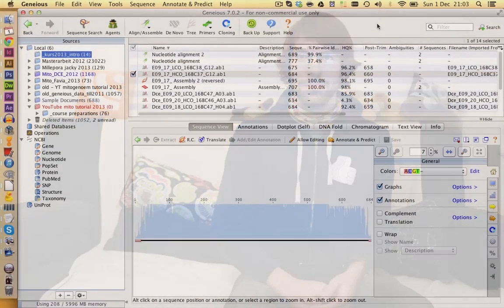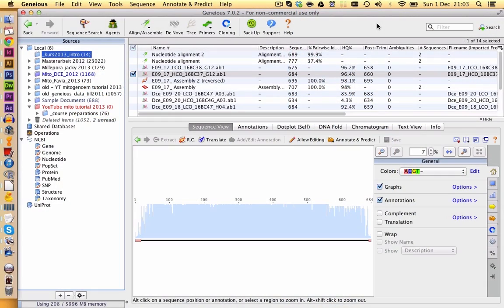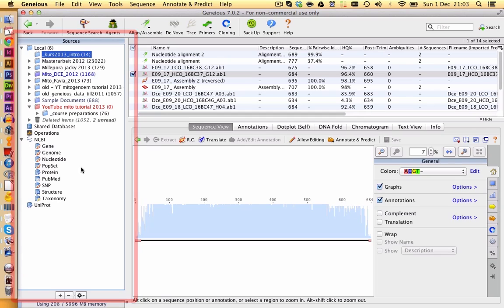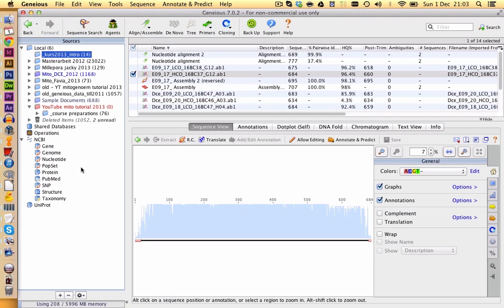So, without further ado, we're going to start with the program. You have here an overview of the program GENIUS. On the left side you will find your folders, where you have all your data stored. You need to keep in mind that the data is stored inside of GENIUS, so it doesn't matter where it sits on your hard drive, it is stored in the program.